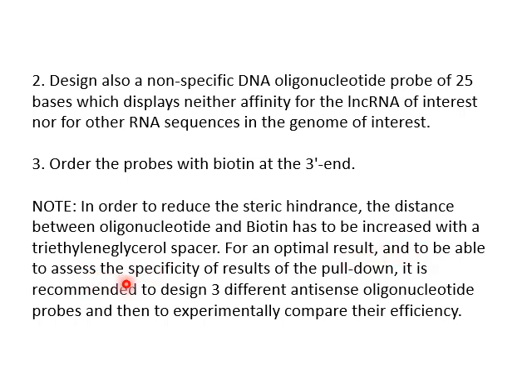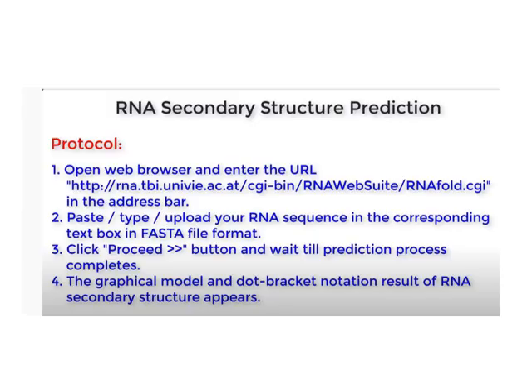And to be able to assess the specificity of the result of the pull-down, it is recommended to design three different antisense oligonucleotide probes and then experimentally compare their efficiency.